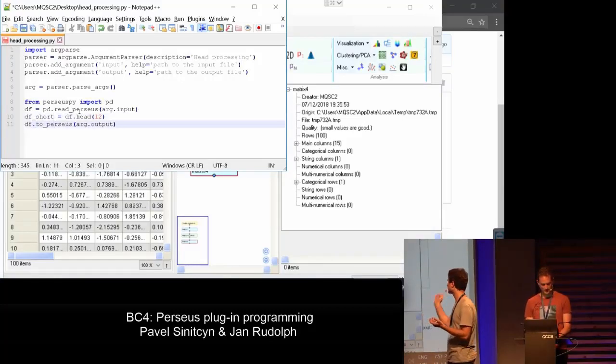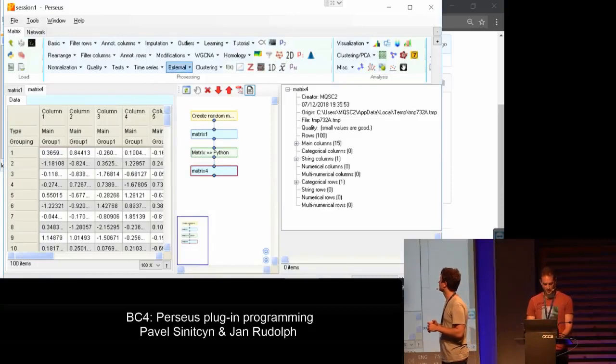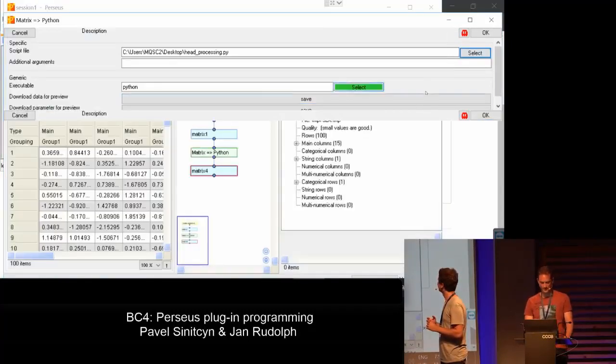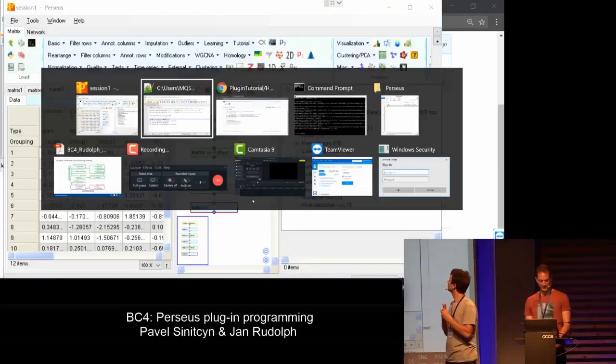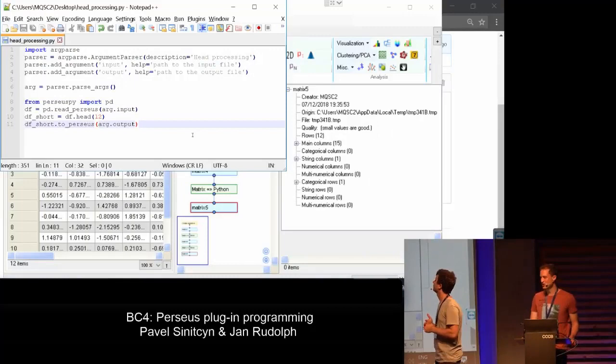So basically, you just move it somewhere, and save the previous one. Okay, I'm sorry for my sloppy coding, but it's fine. I'm tired. Okay. And now it's working. Cool. So you see, we have our most minimal script, and it's a lot shorter than the C# version.